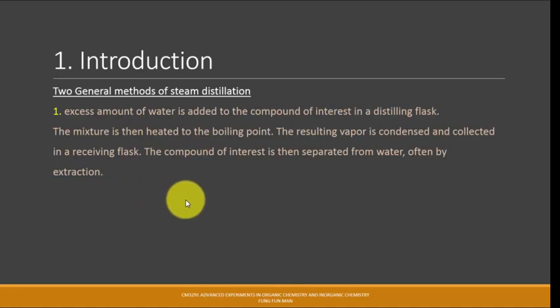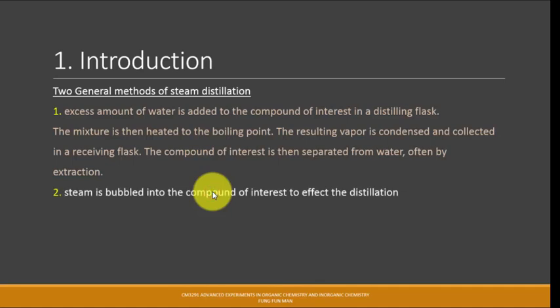Now the second method is, as the word suggests, steam, right? Steam distillation. We could also insert steam via bubbling into our compound of interest, and cause the distillation to occur. Notice? But in this case, think about why we do not use the second method, why we use the first method.